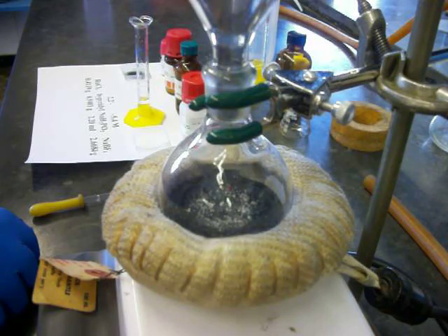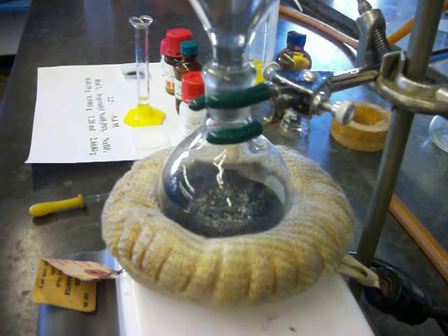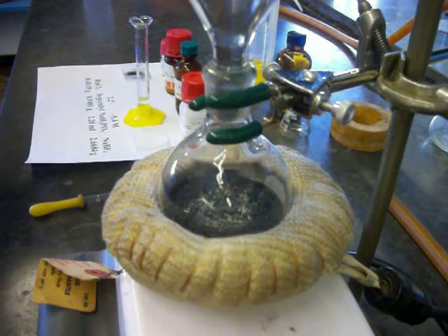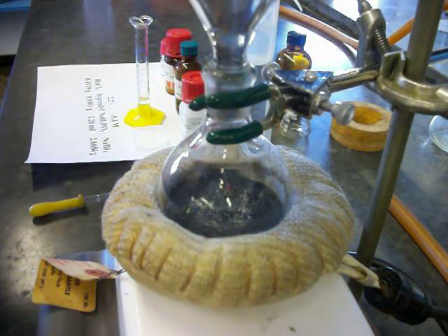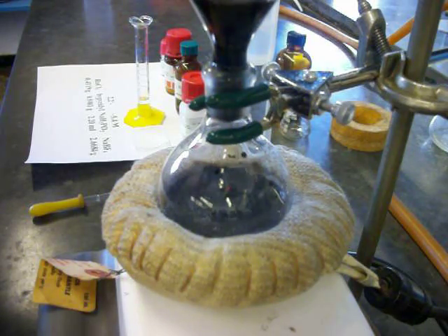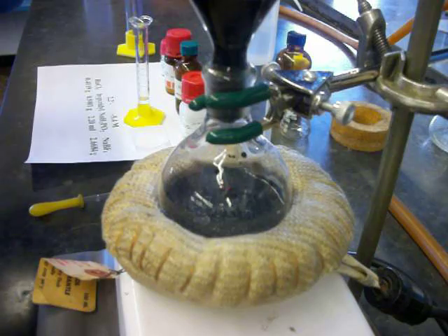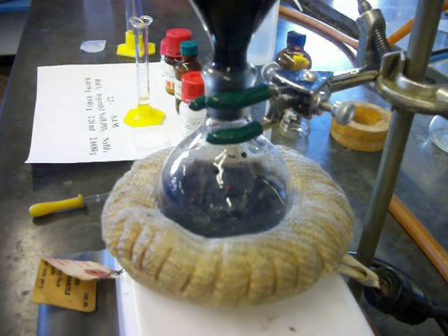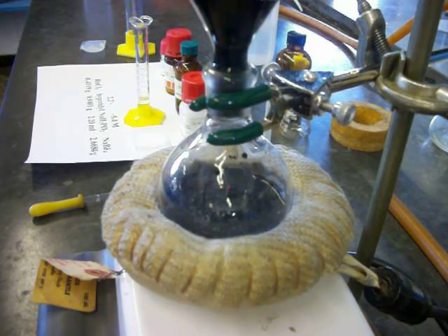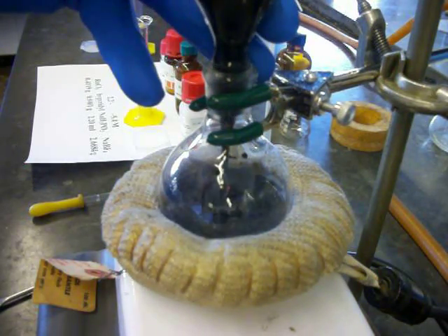That looks good. I'm going to start heating the batch up a bit, and I will use the remaining water to rinse my powder addition funnel. I had a little bit of unexpected surface tension there, but I think we can fiddle around with it to get that liquid in. There we go, just lift up a little.